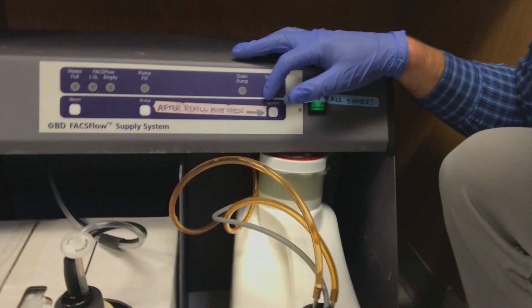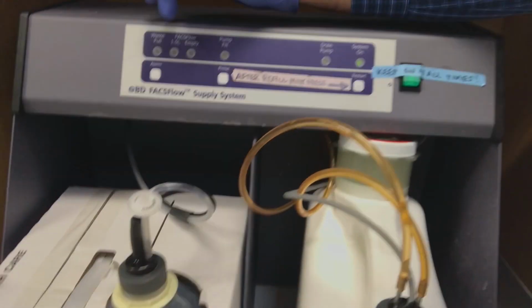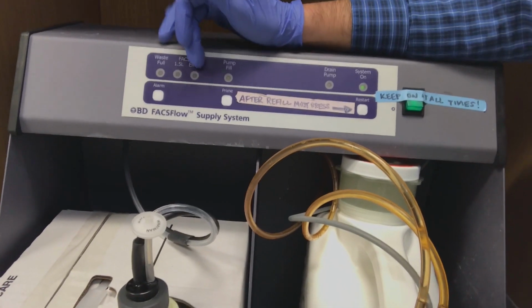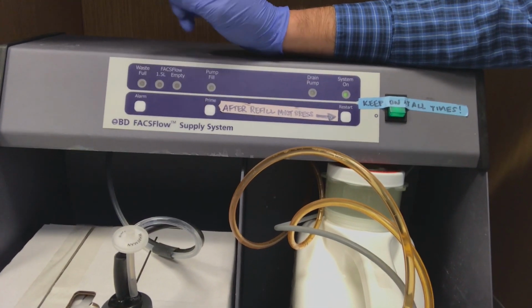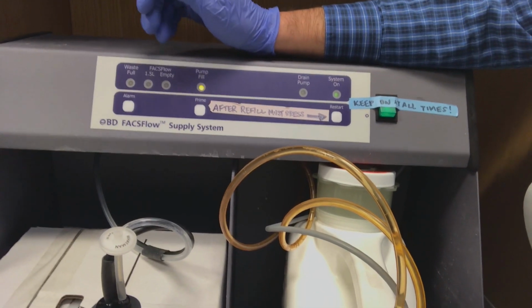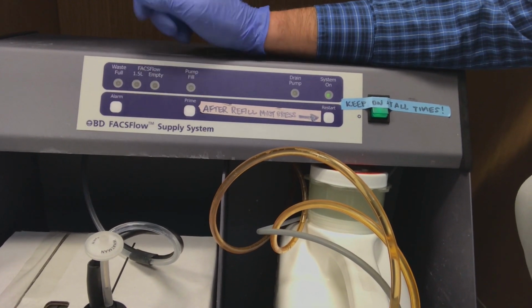Please remember to hit the restart button anytime you've triggered the alarms here. And always look, whether or not you've replaced the tank, that this alarm button, these alarm lights are not on.